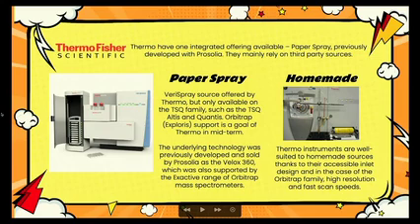There's a variety of different papers that cover what they all do, and they can be split in different ways. You know, there's all sorts of acoustic injection and a huge variety. So we're only just scratching the surface, but these are the ones that you're more likely to find, because they've got vendor support. You're more likely to find them on posters at something like this or ASMS.